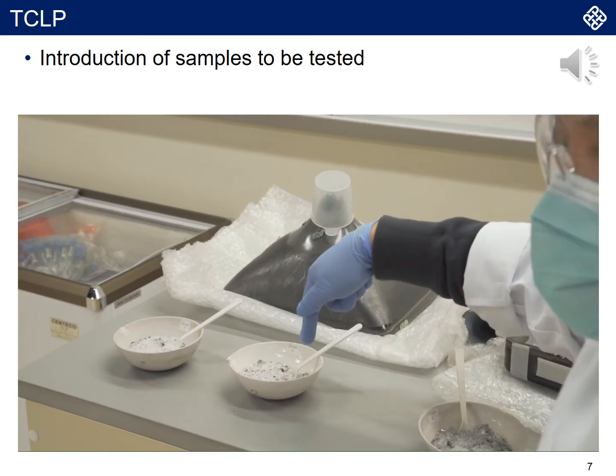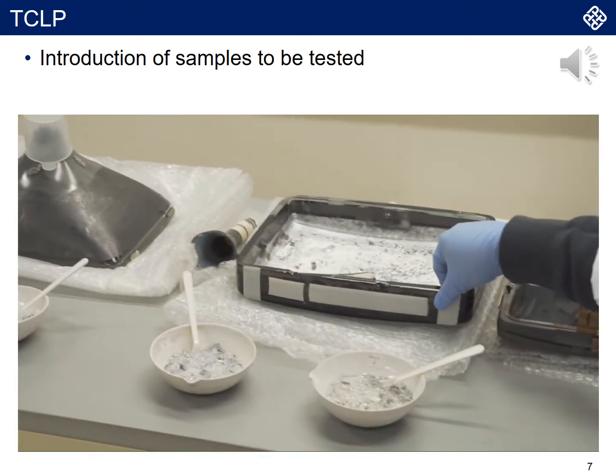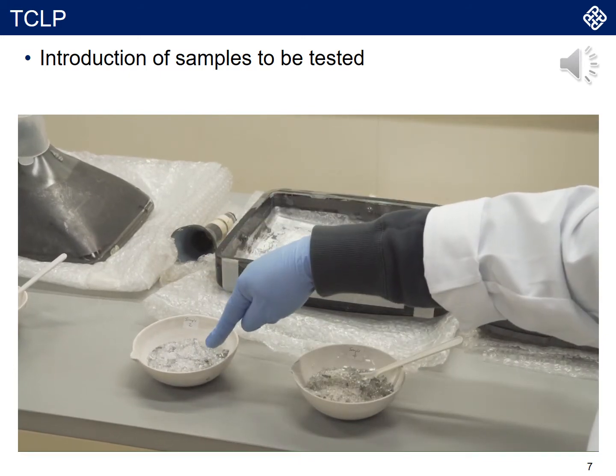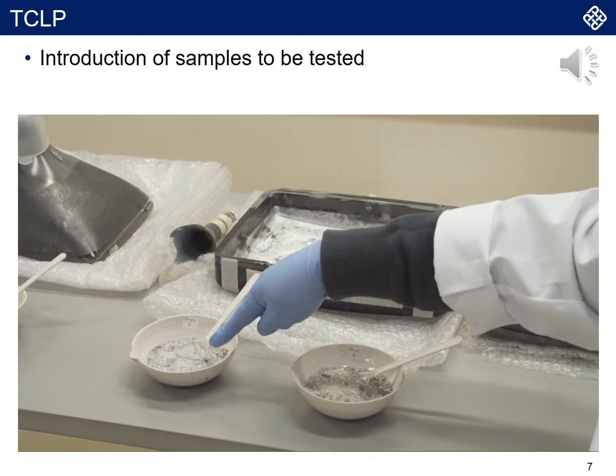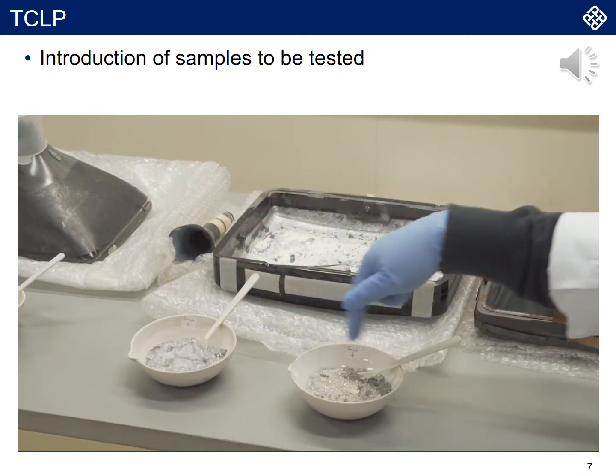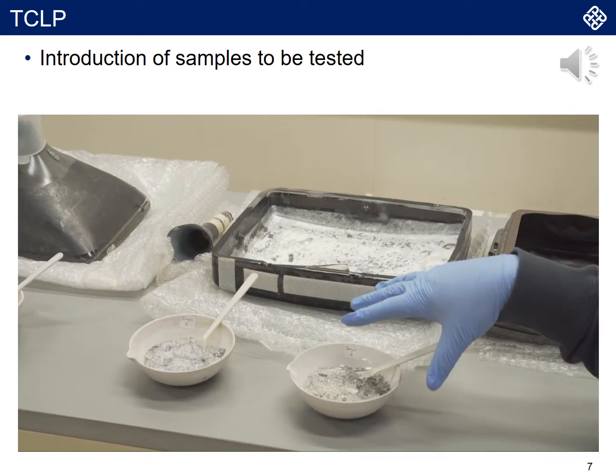In the normal case, the finer the particles, the better the ability of the heavy metal to dissolve in the treatment acid. So in this case, we try to crush it as much as we can.